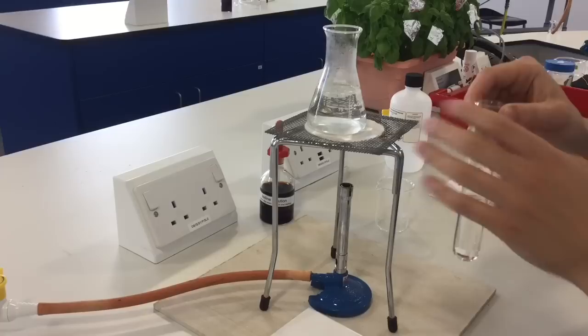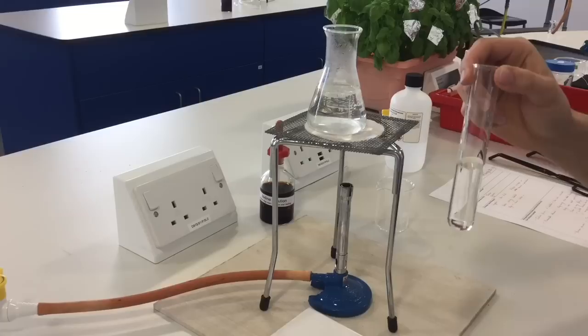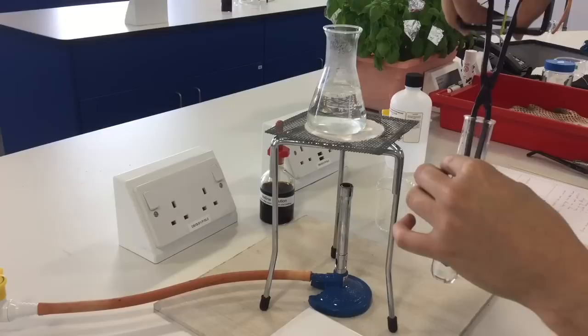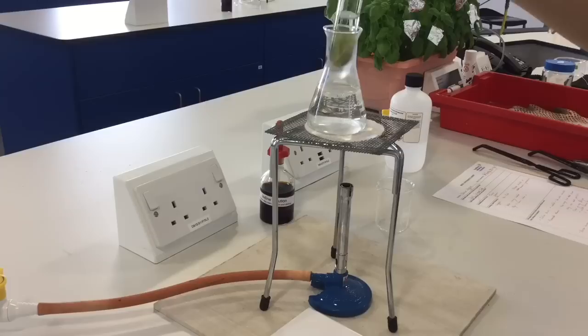Wipe up any spillages and any residues on the outside of your boiling tube before you start the next step. Once that's all safe, you can pop your leaf into your boiling tube and make sure it goes right down to the bottom using your tongs.